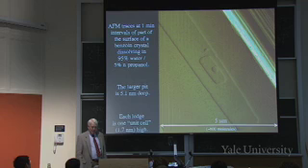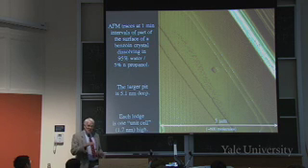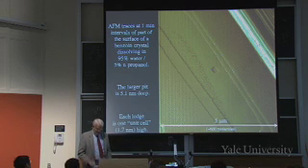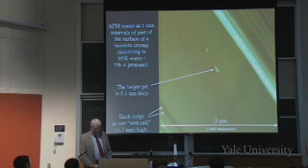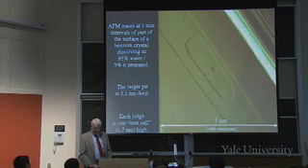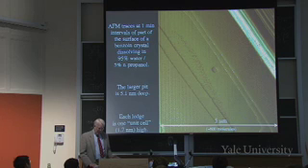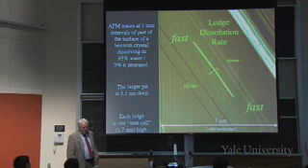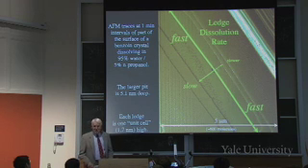So watch. Right? Those are at 1 minute intervals. So we're actually feeling individual molecular heights with this thing. There was an interesting point here that I'm not going to dwell on, but the smallest one did not lose any molecules. If I back up, watch the smallest one. It always stays the same size as the others dissolve. That's an interesting puzzle, isn't it? But at any rate, you can do it. So and you can measure the rate at which different ledges dissolve. Some dissolve much faster than others.